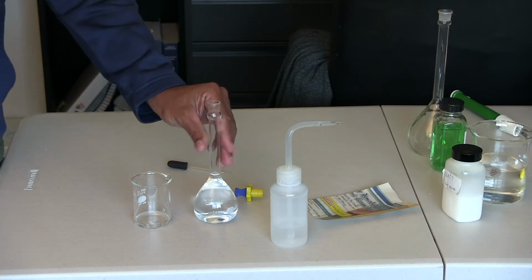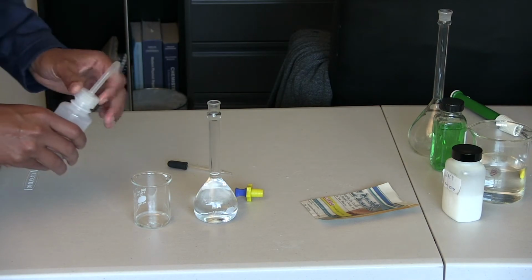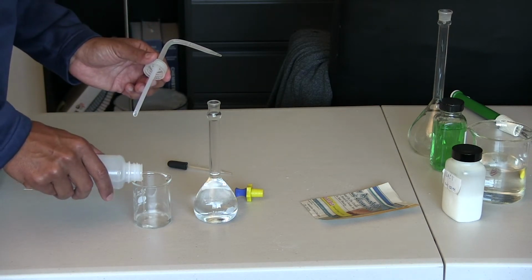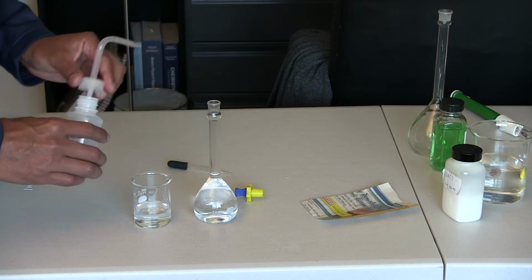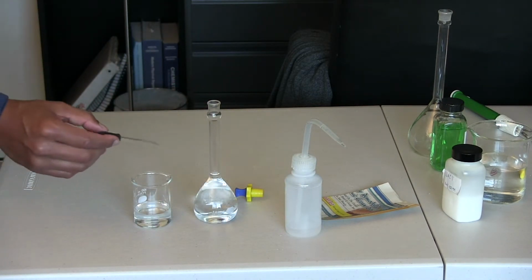Okay, so I've added some distilled water now, but I still have to add some more water so the meniscus is touching the mark. So I'm going to use the medicine dropper here to do that.